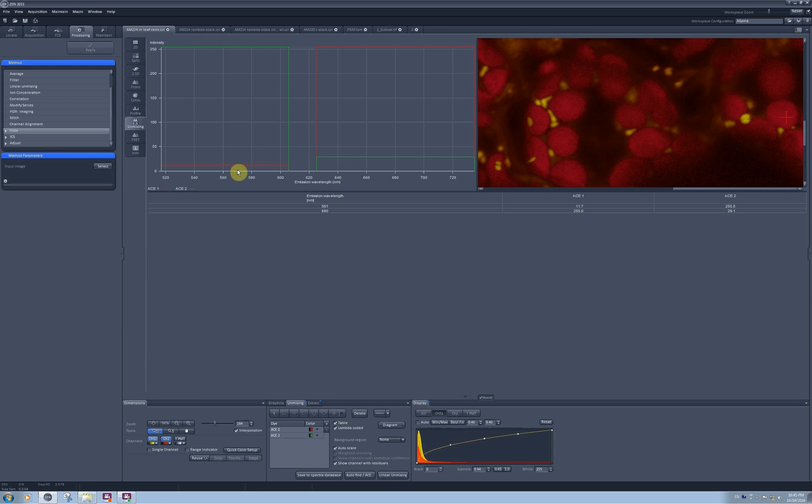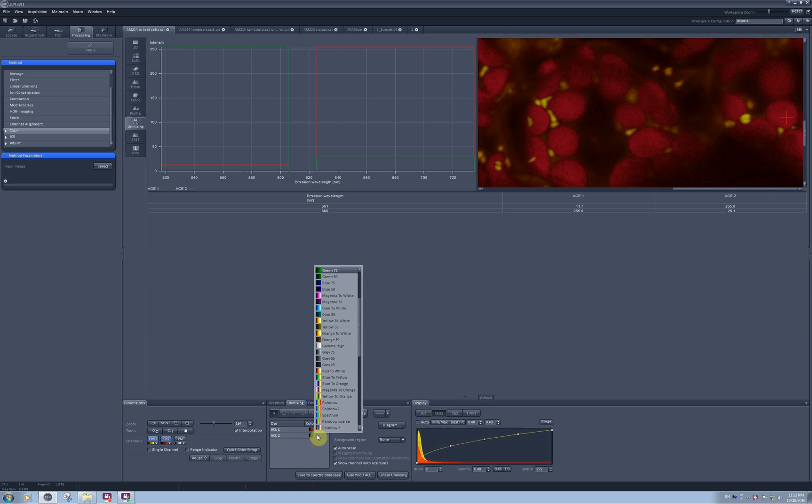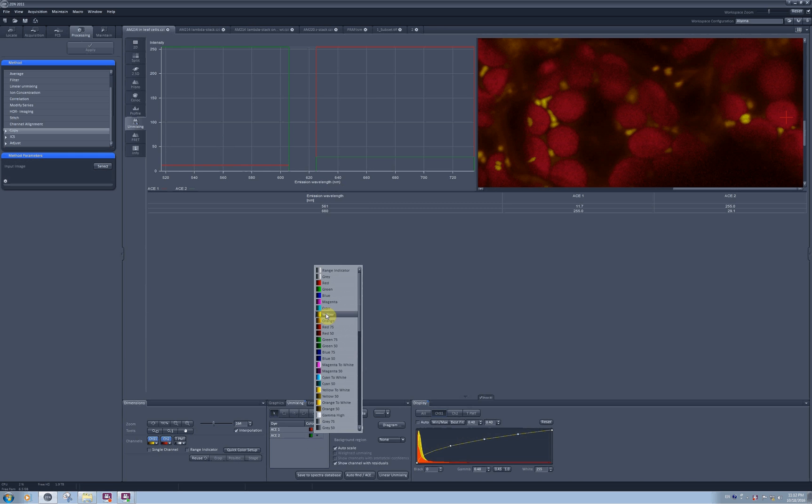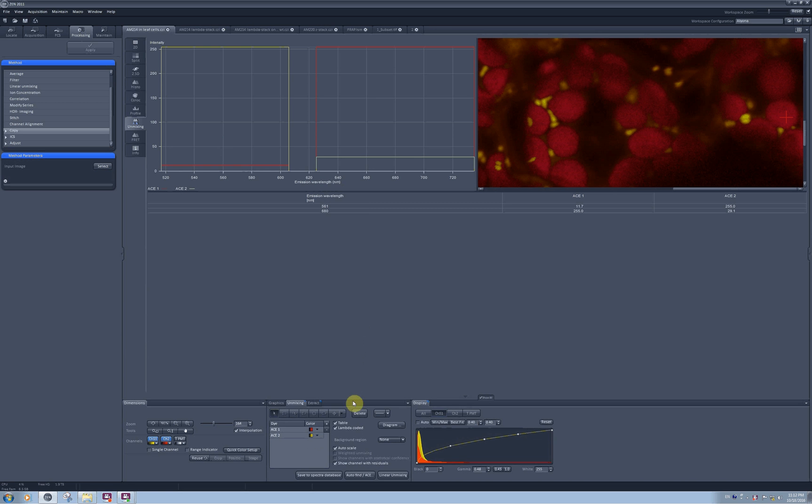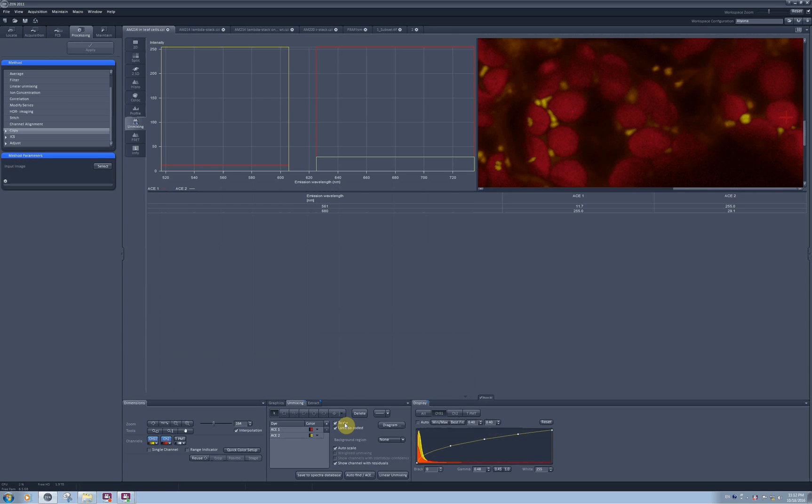The same is valid for the red channel. There are several different options here available, and the software automatically color codes the automatically extracted components 1 and 2 in red and green. Since I have YFP, I would like to keep it yellow, so I just can change it right here. You can select or deselect table to be shown to you or not.